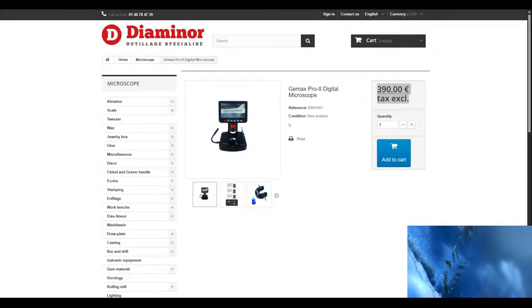I'm trying to describe to you, the optics have no resolution. It's the quality of the optics. Resolution is a bad word. The quality of the optics matters. The resolution doesn't matter, doesn't matter if it's 1080. 1080 is more than enough, and this is 1080 basically.